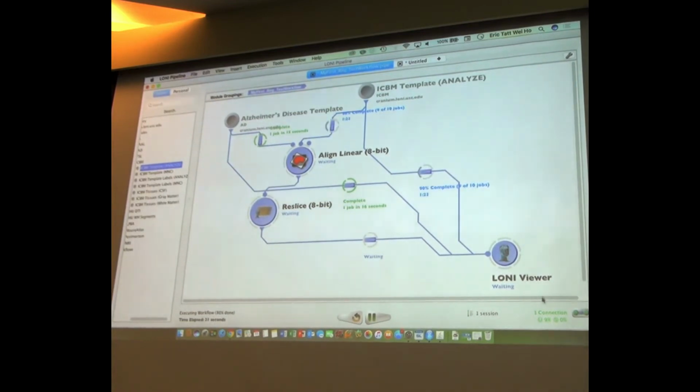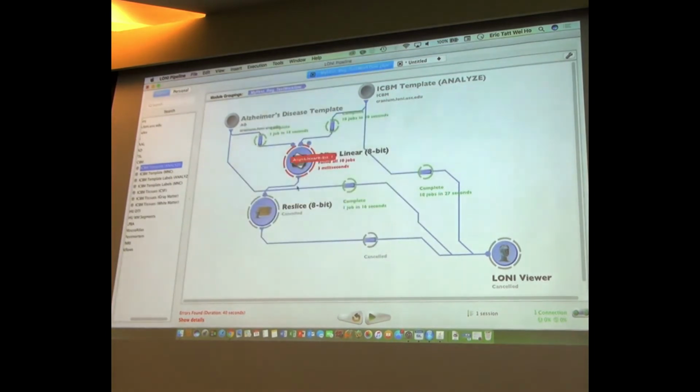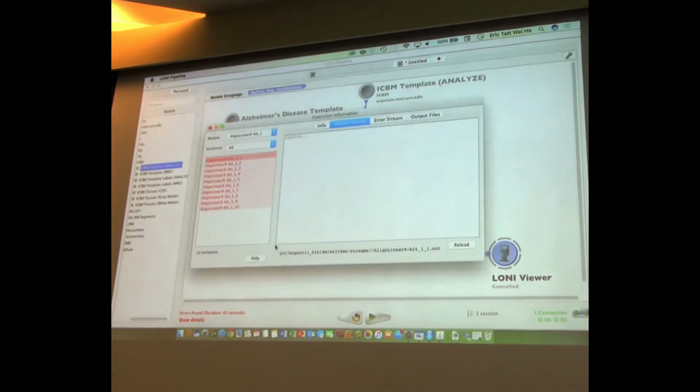Oh, by the way, while this is running, let me just show you. Click here and you're going to see the tick mark, when jobs finish, okay, and it failed again, so I'm down to 0. That's unbelievable. Something is wrong here. The server is not at 0%, but you saw the speedometer was ticking up and down when my jobs were running, okay? So you can track down, you have a quota, okay? I cannot run more than 143 processes. They're going to be queued if I set something larger than that. So let's see, is it the same problem? And why is this?